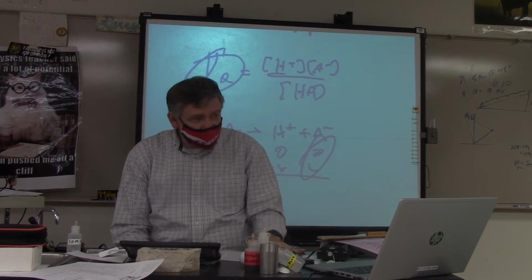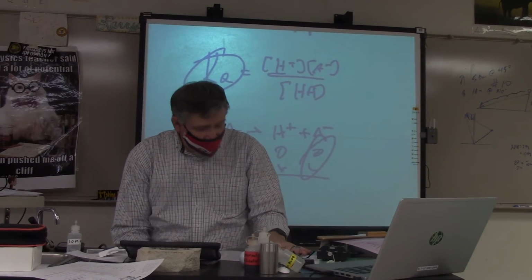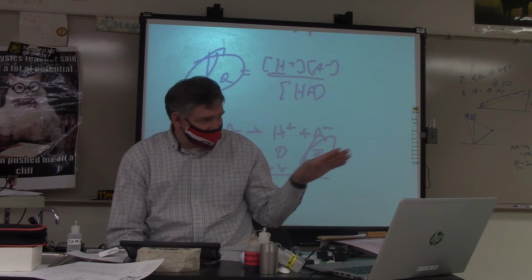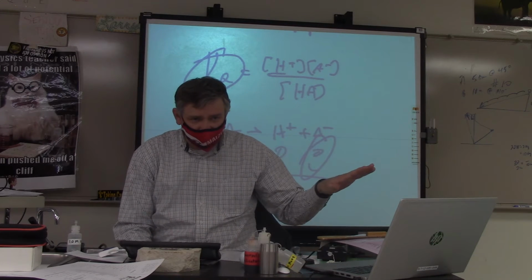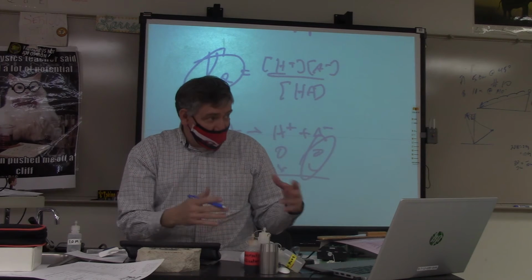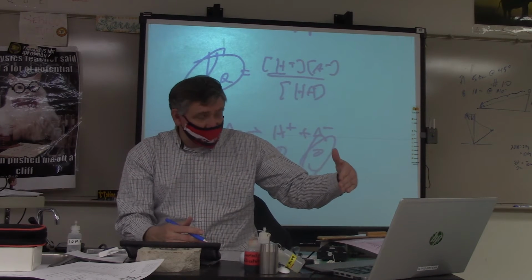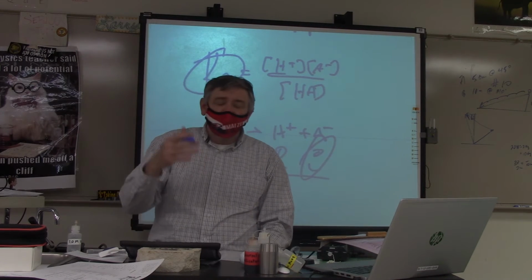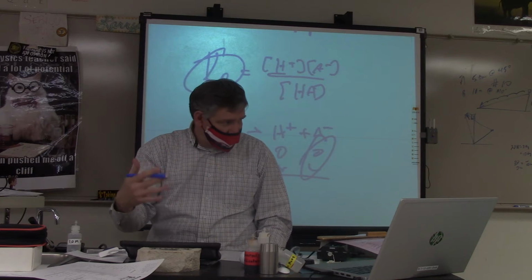So check with me before you do that, because if that number is wrong, that third titration is just screwed from the get-go, okay? Now, obviously, it's going to take more mass than the calculation on number 2, because that only raised the pH to about 4, okay? That third calculation, you want that pH to start at 6.